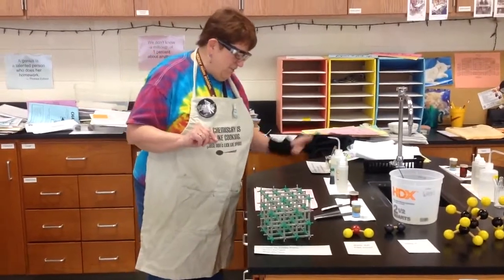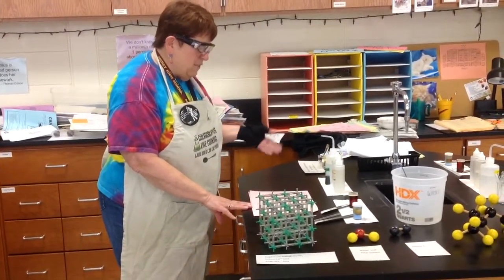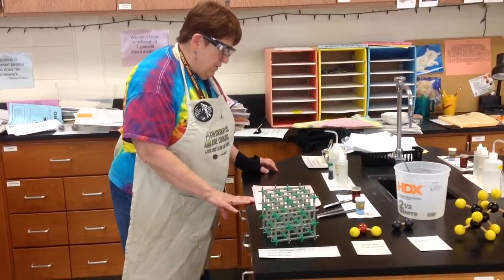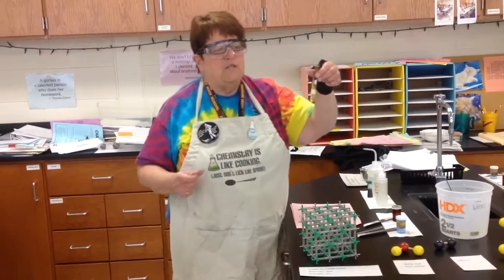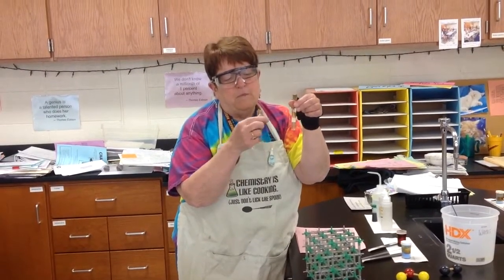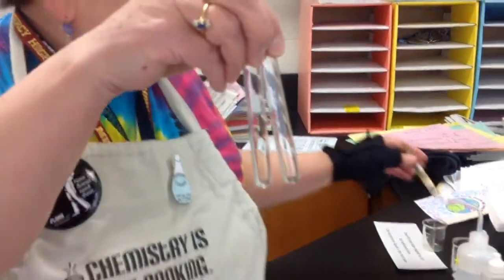All right, at this station you're looking at solubility, what types of things will dissolve in other types of things. So we have liquids, solids, and liquids, liquids and liquids. First of all, liquids. It says to take 3 milliliters of water and put it into small test tubes. We have a test tube here for comparison. Do not use this, just use it for comparison. At the mark where the tape is, the top of the tape is 3 milliliters. So just hold these other 2 test tubes next to that and put water approximately to that volume that you see on the tape. All right?